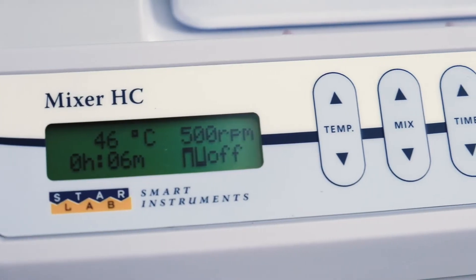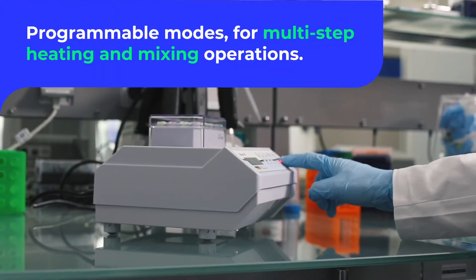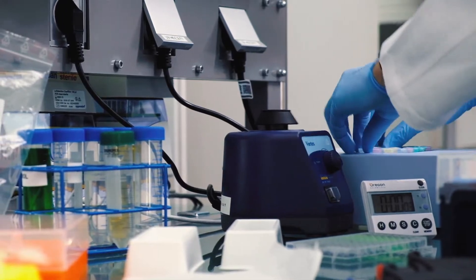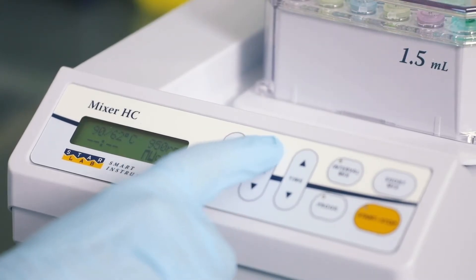Set temperatures ranging from 13 degrees below ambient up to 99 degrees. The unit is fully programmable, with functions including Short Mix to mimic a vortex, Interval Mix for a simple two-step program to combine mixing and resting intervals, and Programming Mode for up to four different steps.